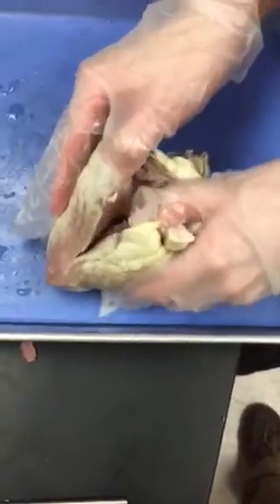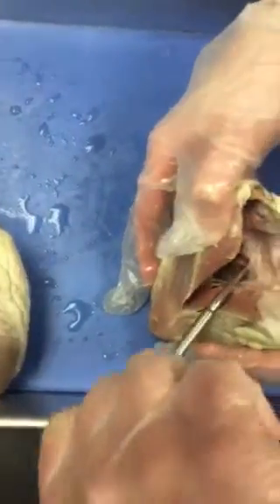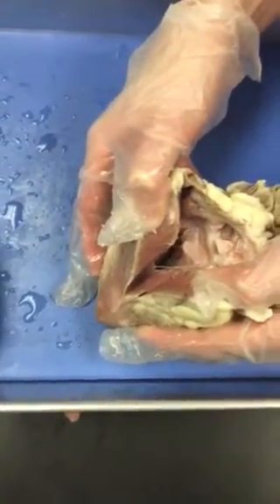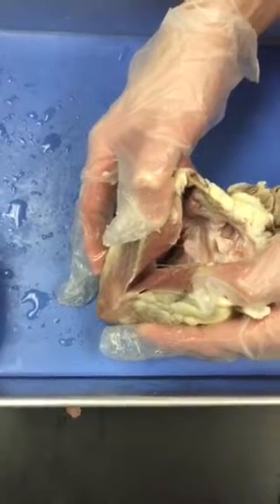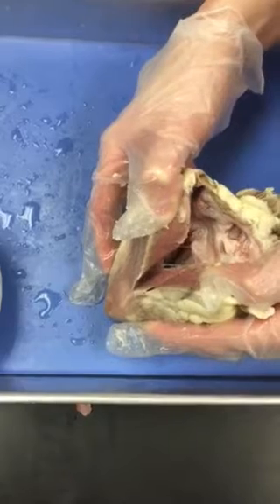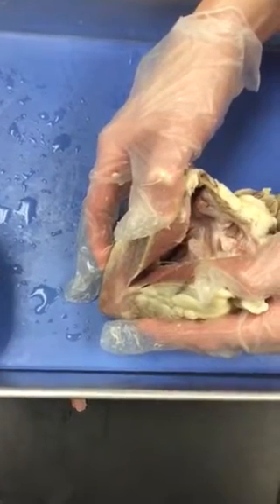38. Find the mitral valve, sometimes called the bicuspid valve, in the left ventricle. It looks similar in appearance to the tricuspid valve. In the space below, describe its appearance. 39. In the space below, explain the function of the mitral valve. 40. Check which structure is the aorta by placing your finger or a probe into it.